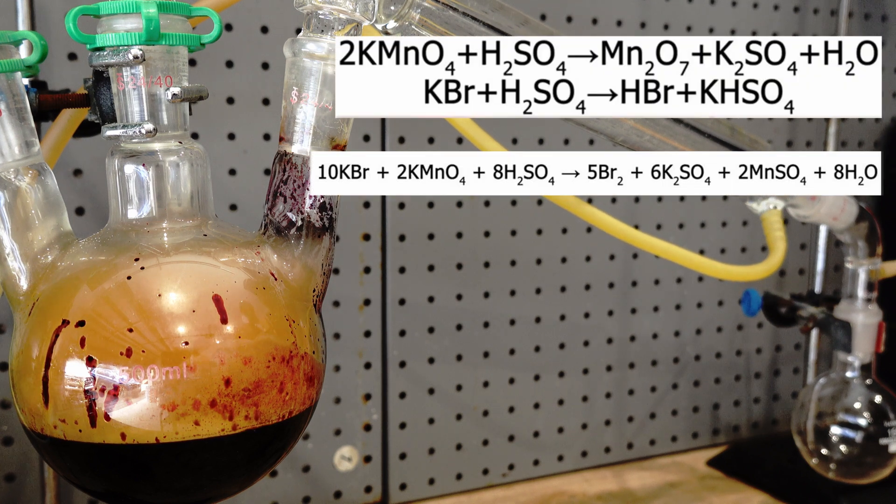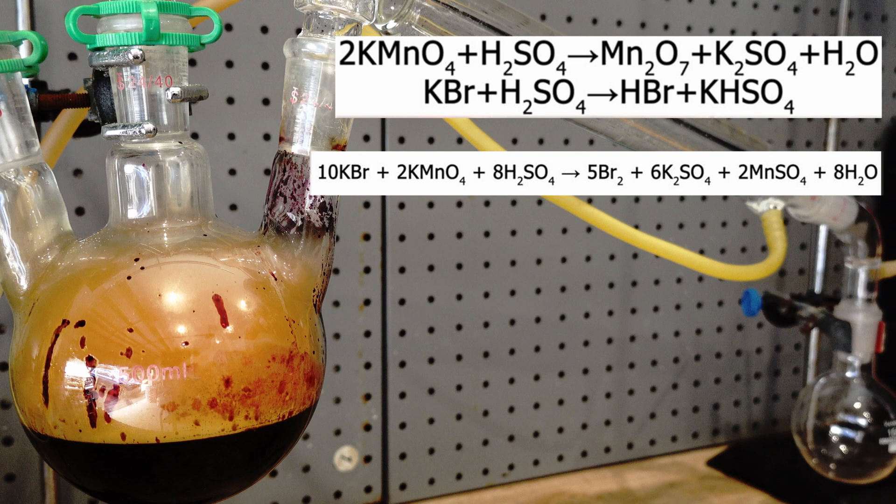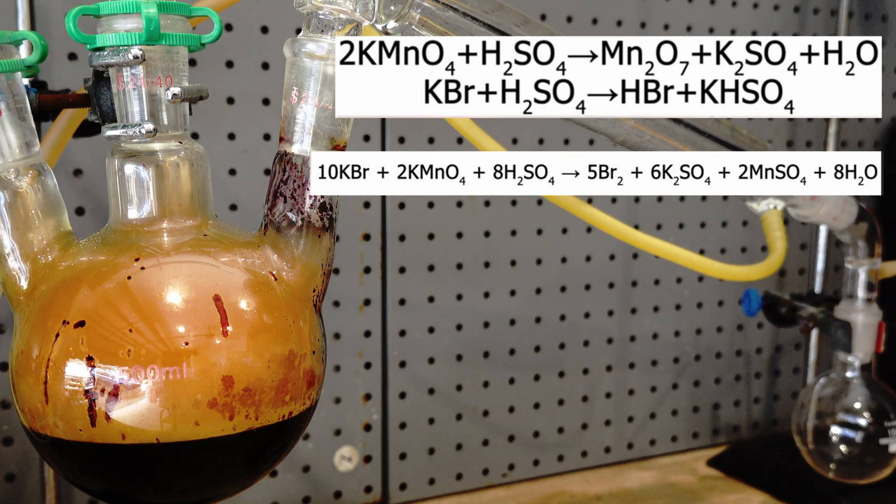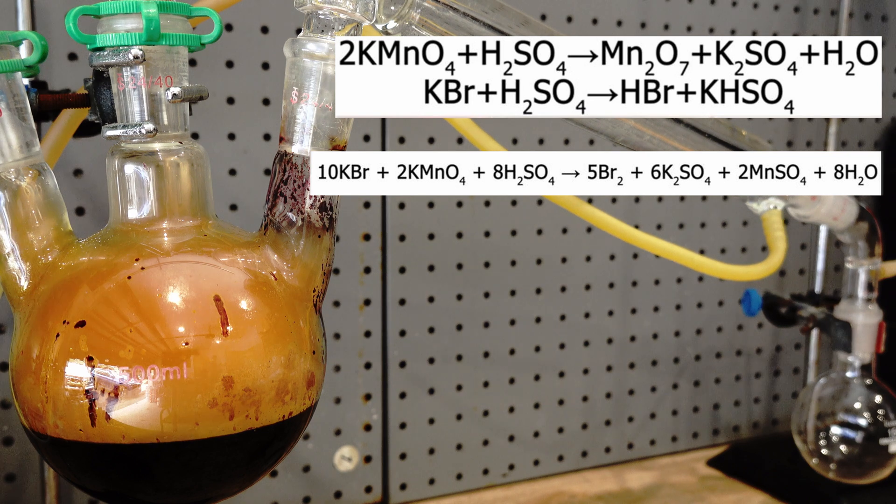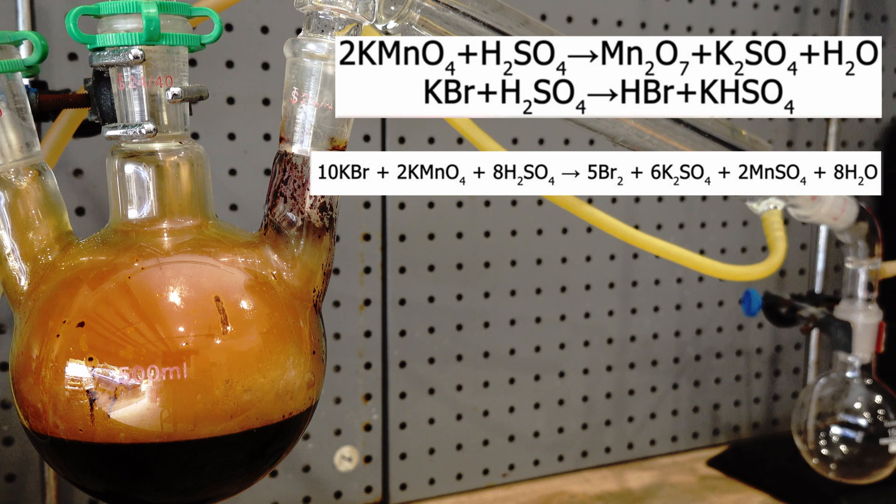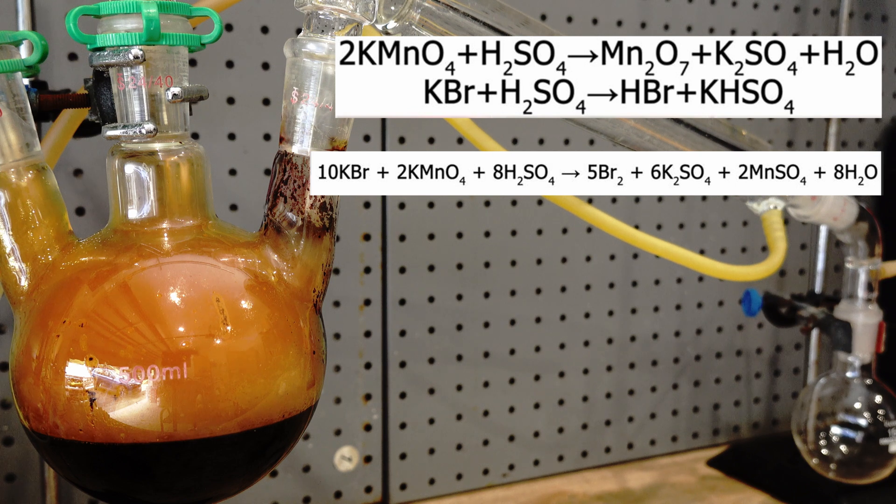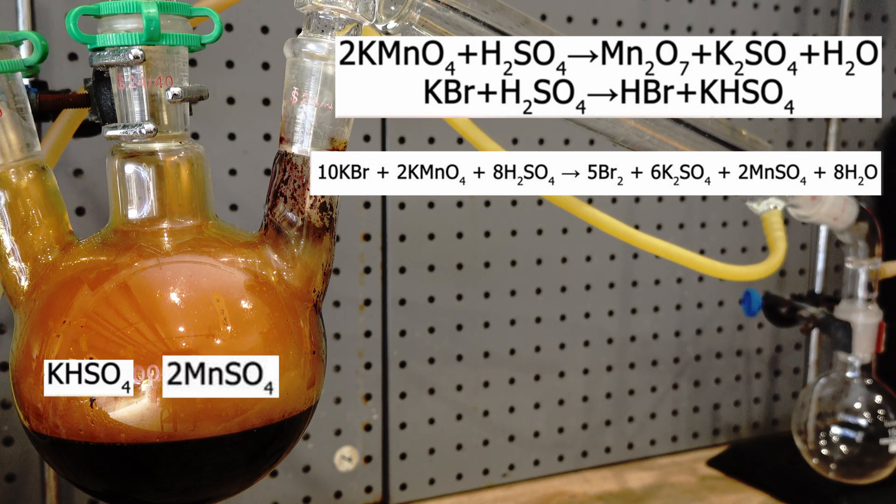The reaction going on here is a redox reaction. The potassium permanganate, as a powerful oxidizer, is readily oxidising the Bromine anion in potassium bromide, forming elemental bromine which instantly boils off due to its low boiling point of approximately 59 degrees Celsius. The remaining products remain in the reaction flask as they are mostly solids such as potassium bisulphate and manganese sulphate.